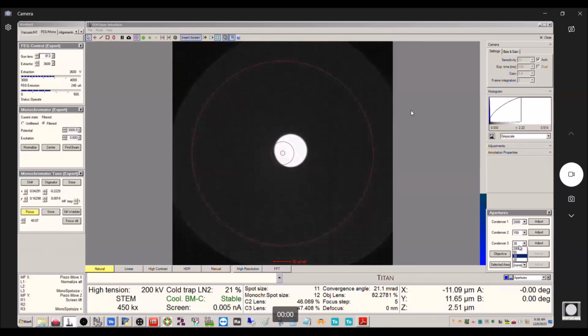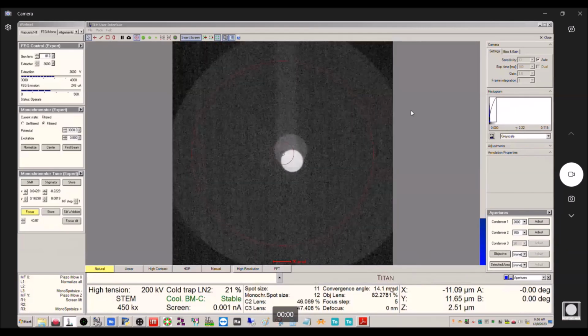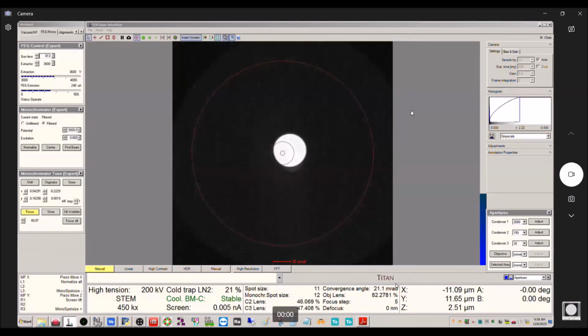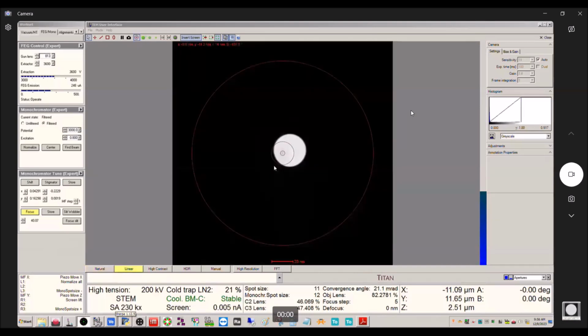And again, I don't know if this is accurate. We'd have to actually measure it to find out. But this was the one that I remember using before, which is right in the sweet spot of our tableau if we pull up this guy. Okay, so that will work fine. I'm going to turn diffraction off.